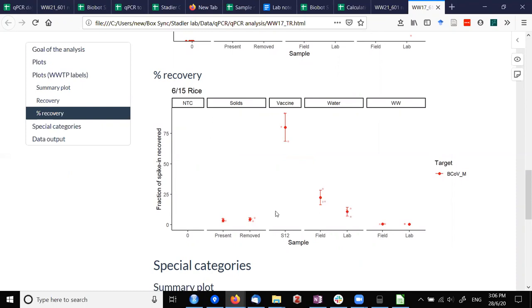Yeah. 25 or less. As long as these recoveries are consistent between weeks, then I think it still matters. Yeah, right? But I guess the biggest improvement in method, if we keep running this water stuff, whenever we are trying to improve the method, just like the DI water spiked in different time points, I think that will be very helpful.